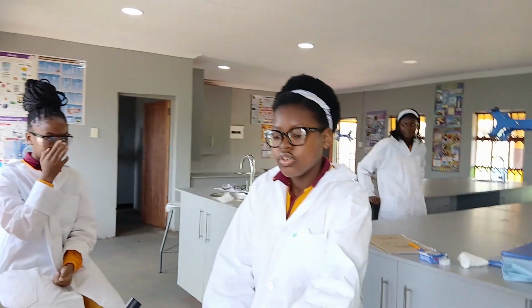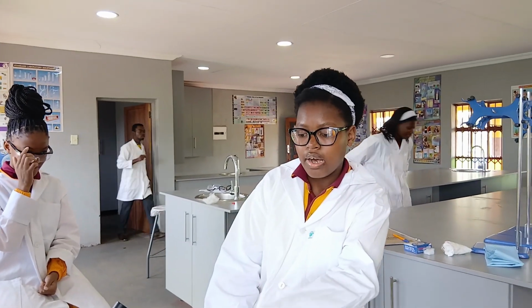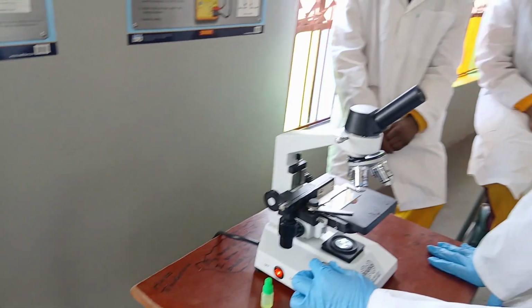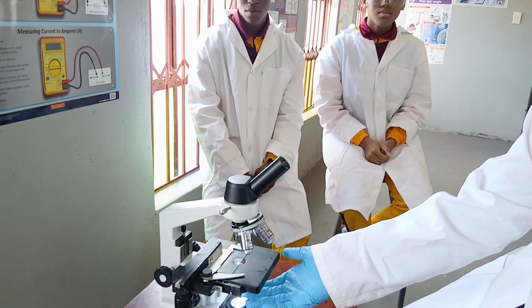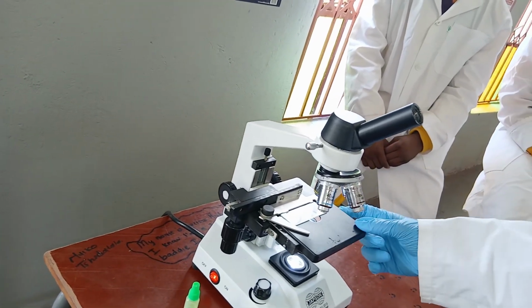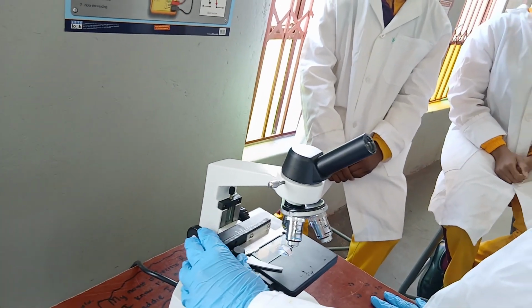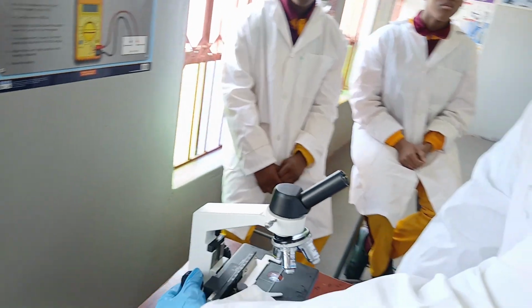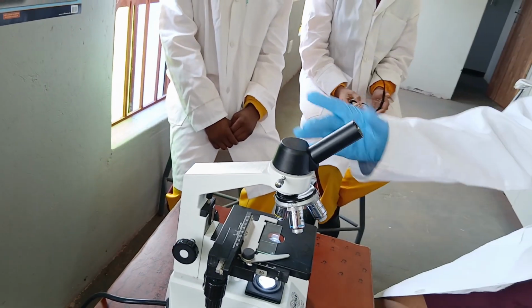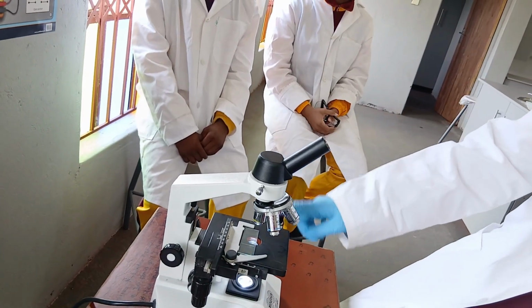First, we have to make sure that our microscope has a power source, and then we turn it on using our switch, where it will emit light from the light source onto the diaphragm, reflecting onto the microorganism, which will be on the stage, which we have mounted. We can then use our coarse adjustment to adjust the stage up or down to see the microorganism more clearly.